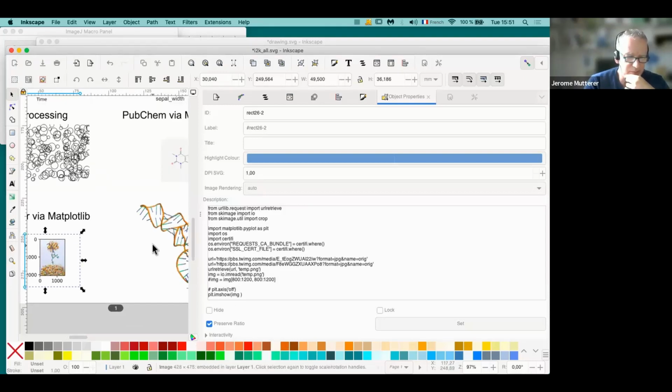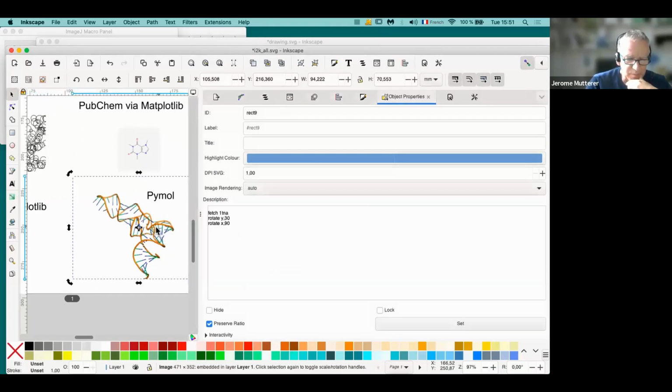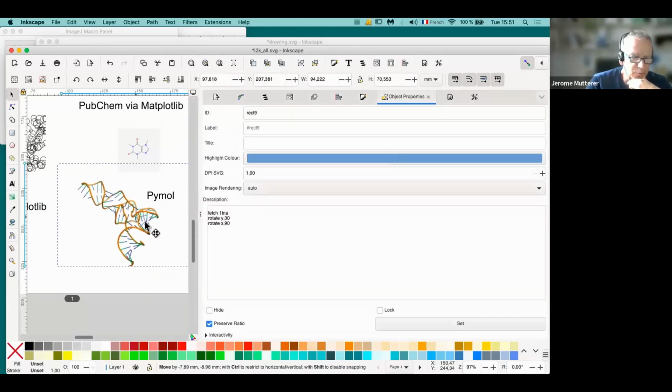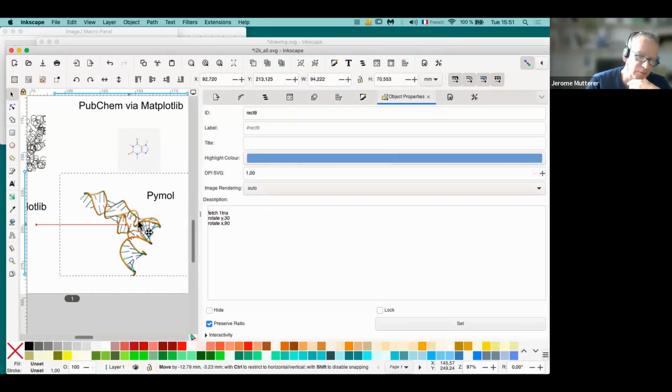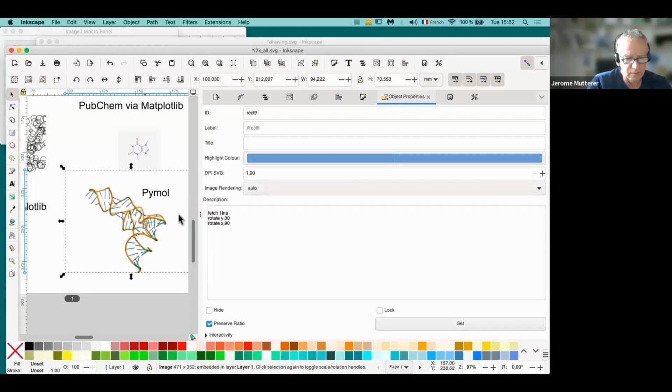This is the idea behind this presentation. So this is the example with PyMol. And you see, you retain the full flexibility. You have your PyMol object, but this, you don't want to script this, because this you want to place exactly where you want. You have to retain flexibility for this. But for the molecule, it's there.